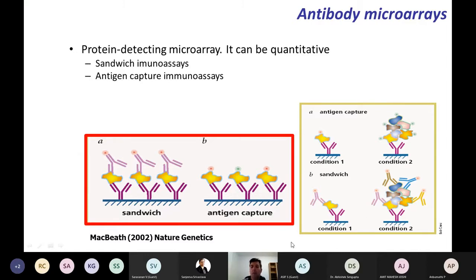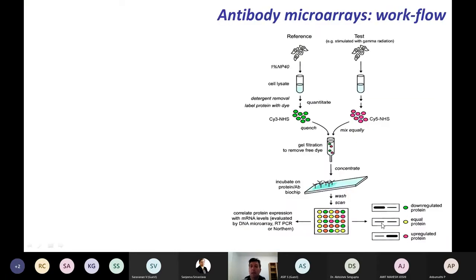This is the situation that we usually think about when we are using protein microarrays. But you can also have in mind that if we work with a protein that forms part of a complex, we can also have these situations. The antibody captures our antigen of interest, but in the complex with all the other proteins that form part of the complex. This is just to have this message at home, because this situation is usually avoided. Usually people do not consider this situation.